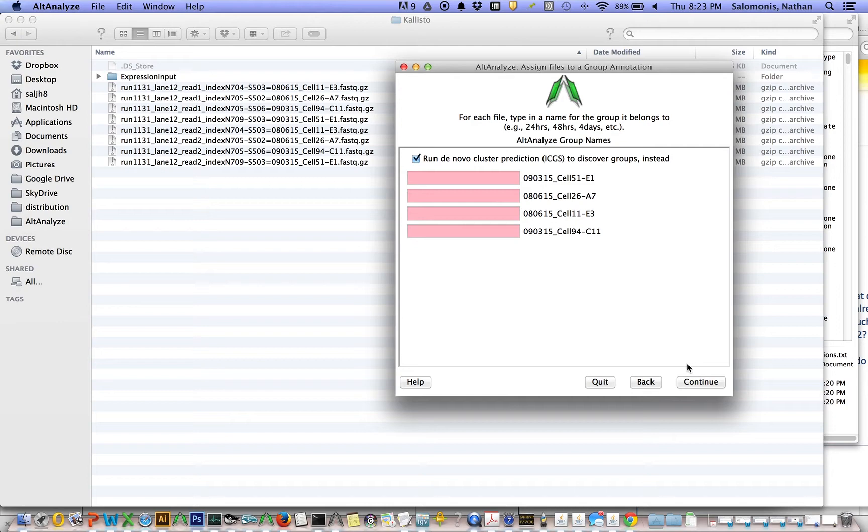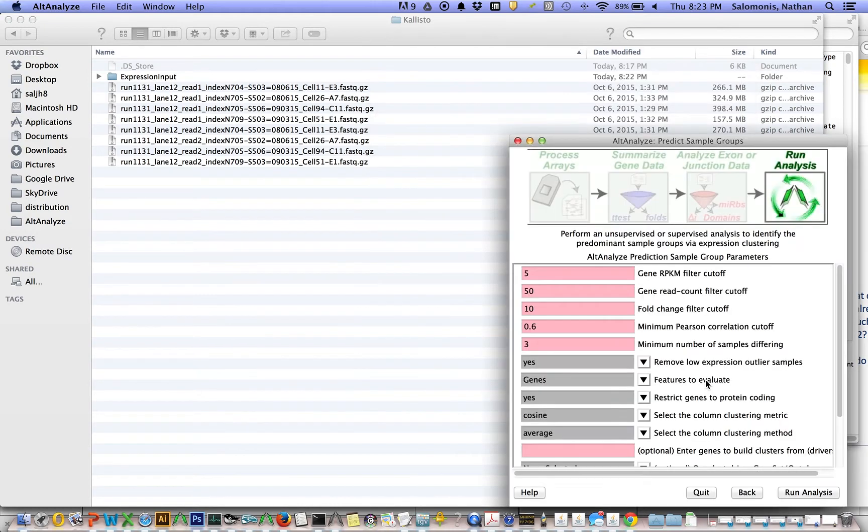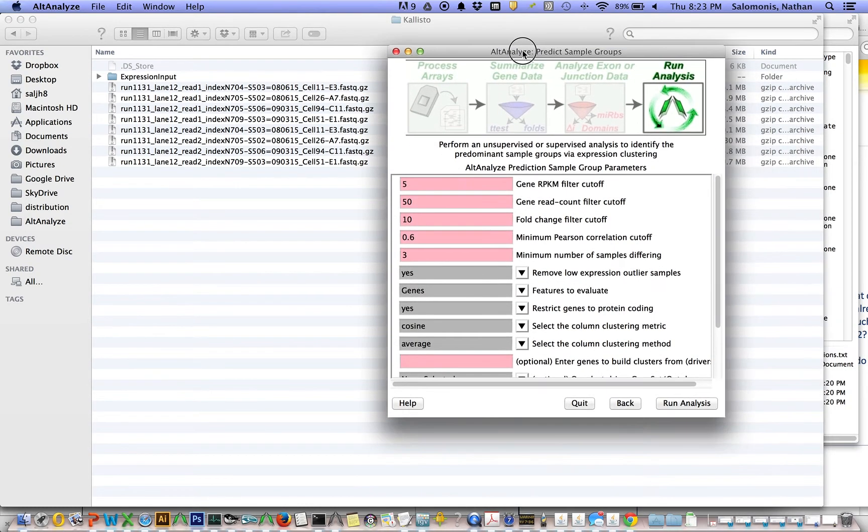The analysis works very similar if I were, for example, to say disease, disease, normal, and normal, and then select my comparison groups. But instead, I'm just going to let the program identify these subgroups for me.